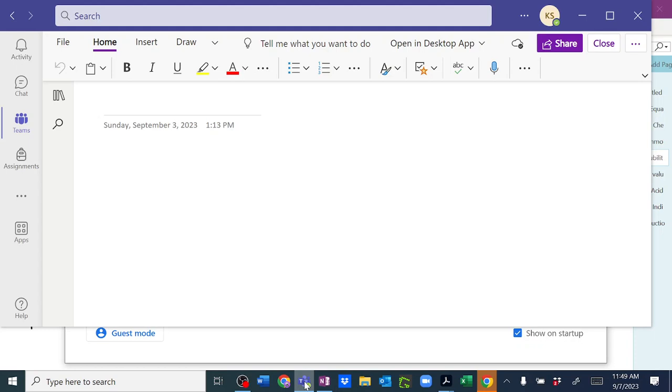Yes, we would get a curve. Now, it's not easy to read numbers off a curve. It's not easy to get the equation of the curve. We straighten that line by taking the negative log. Okay. Thank you.